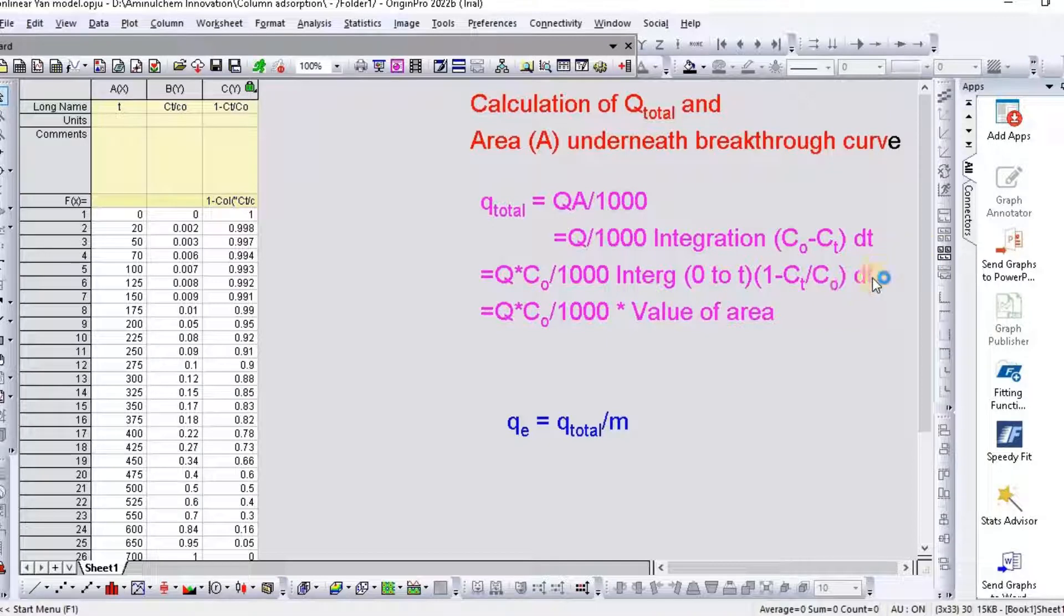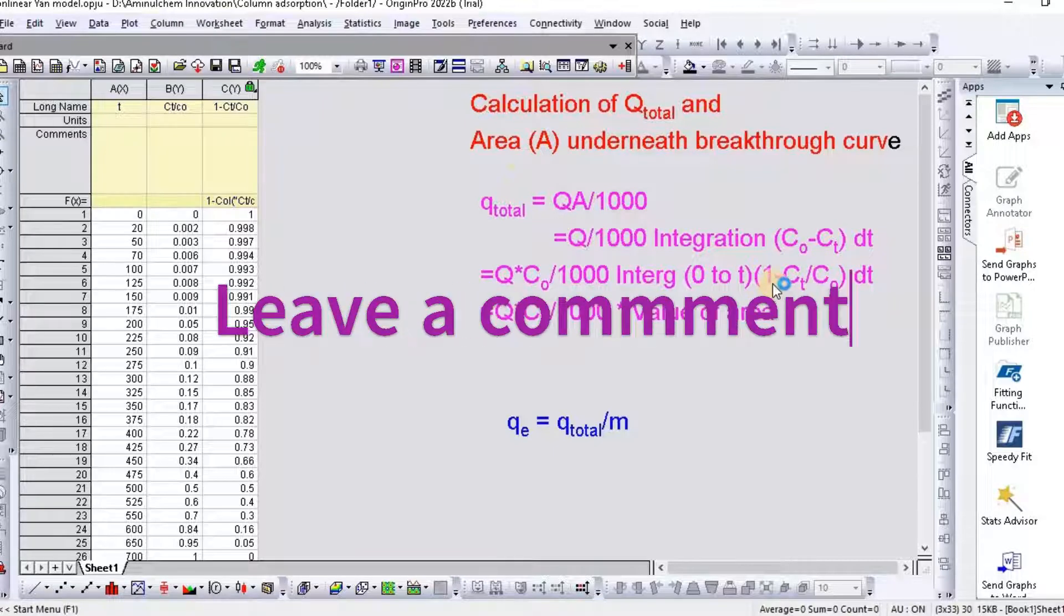So in order to calculate area A, you need to first convert 1 minus Ct divided by C0.